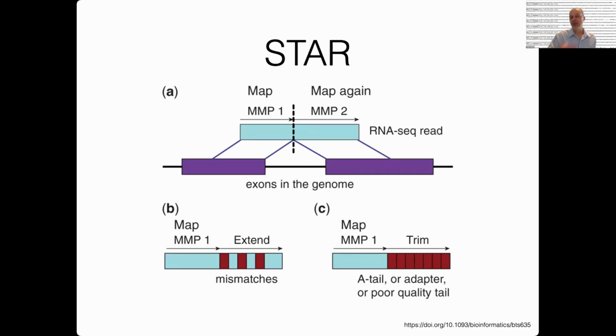That is biological sequence that's being added by polyadenylation polymerase, but it's not in the genome. So if you try and map this whole read to the genome, you're not going to be able to map this. And so STAR, again, is aware that there is this sequence that might be in the read, in the sequence data, that's actually not going to be in the genome, and it handles that correctly also. Questions about any of that?